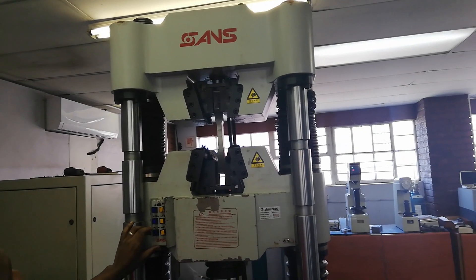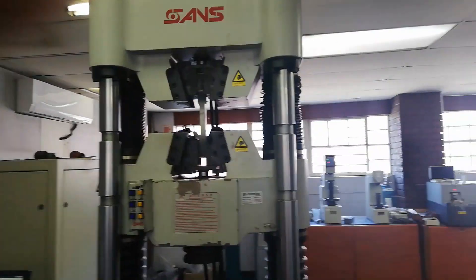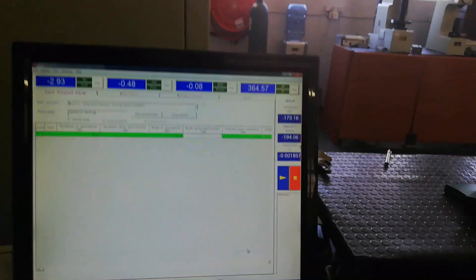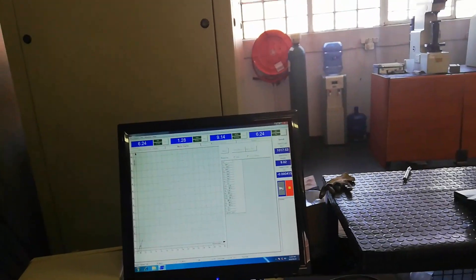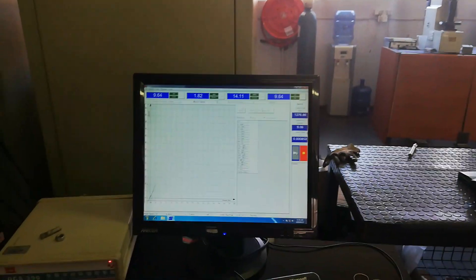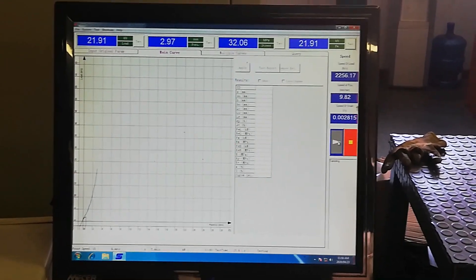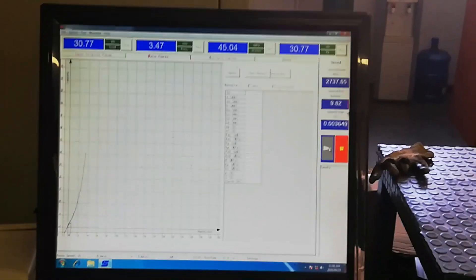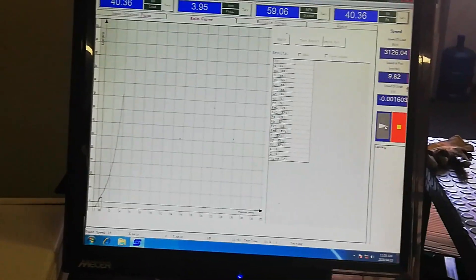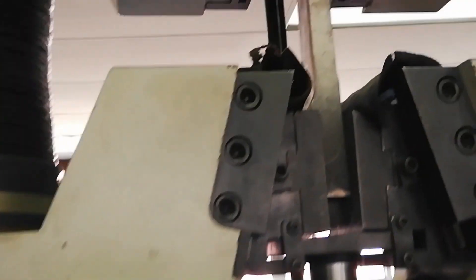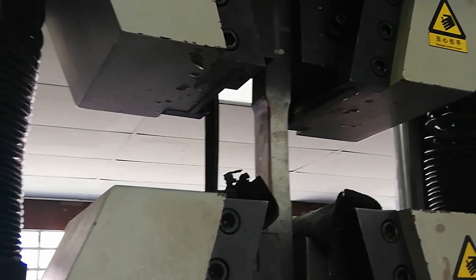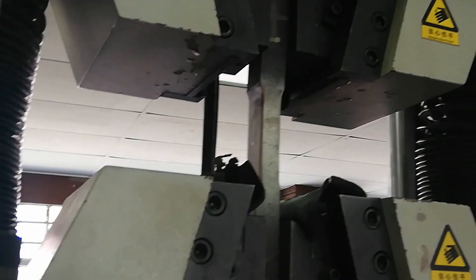Once I'm done with that I'm going to go to my computer and start doing the test. Check — there's my graph starting. This is in the range of elastic deformation — as you can see the graph is going on a straight line. Look at the sample, it's being stretched and the graph is straight.